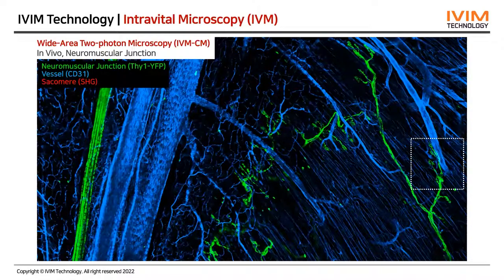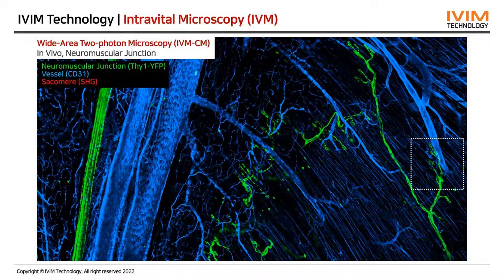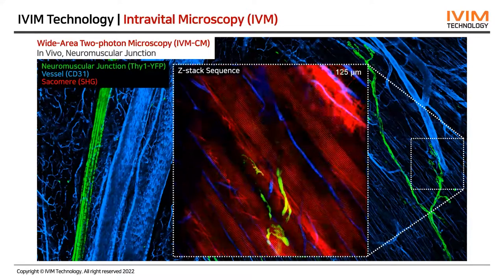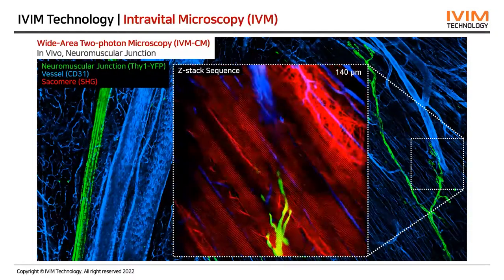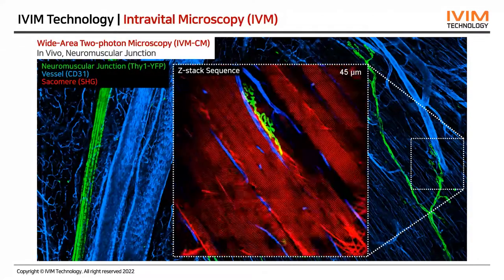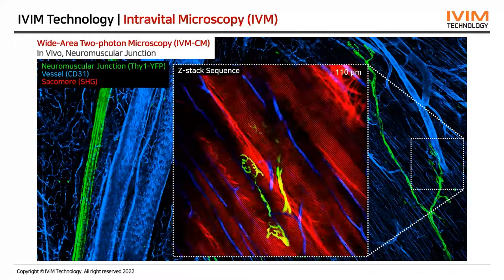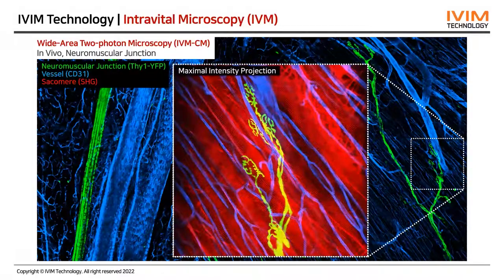This is a wide-area image obtained from skeletal muscle of a live mouse model using the two-photon model IVM-CM, which clearly shows blood vessels in blue and nerves in green. In this single field-of-view image, you can clearly see the red sarcomeres in myocytes with SHG signals without additional labeling, and green neuromuscular junctions and blue capillaries in a tomographic manner. The whole cellular-level distribution is more easily seen in the maximum intensity projection image.